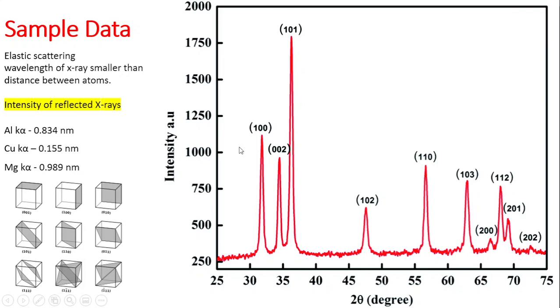And basically, as I mentioned before, you have to keep in mind that this technique is slightly different from XPS. In the case of XPS, you use AlK alpha X-ray or MgK alpha X-ray, and if you look at the wavelength of these X-rays, they are between 8 and 10 angstroms, which is more or less the size of the atom. So when these X-rays interact with the material, they undergo inelastic scattering, or energy loss, when they interact with the material.